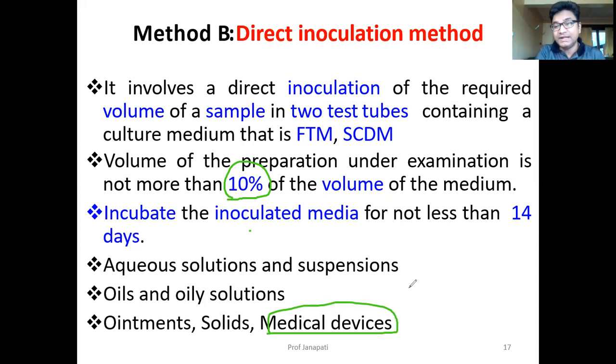Suppose it is medical devices, syringes or IV sets, then you need to dissolve them, place them in a solvent as specified in the pharmacopoeia, and that solvent is subjected to either of these two methods, that is the filtration method or the direct inoculation method. So these are the various methods.